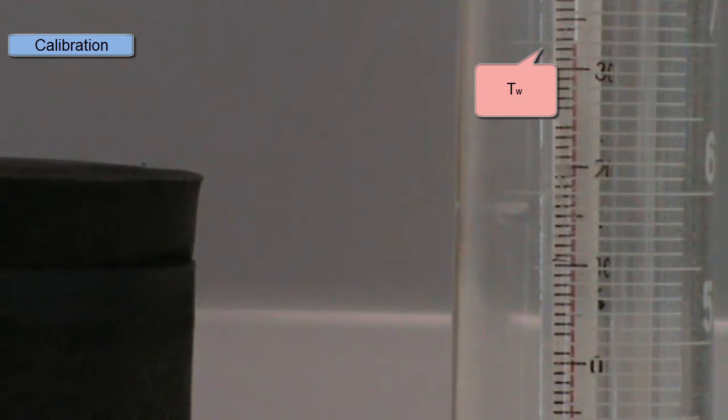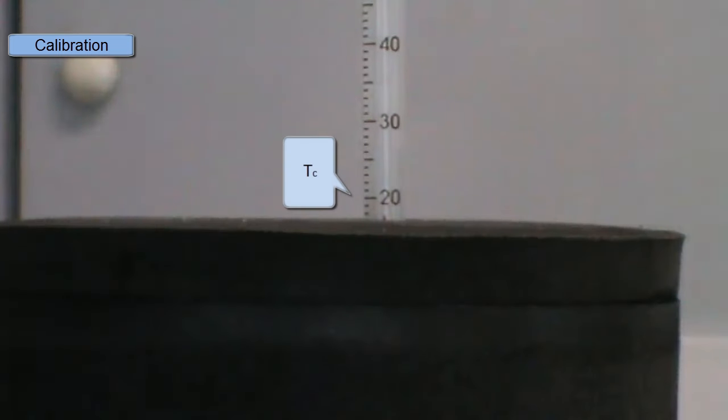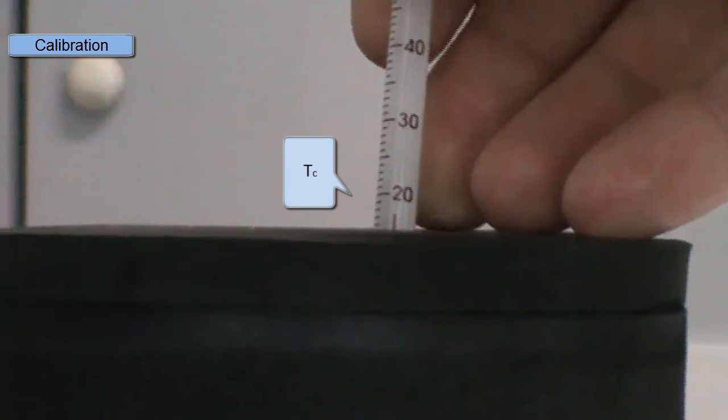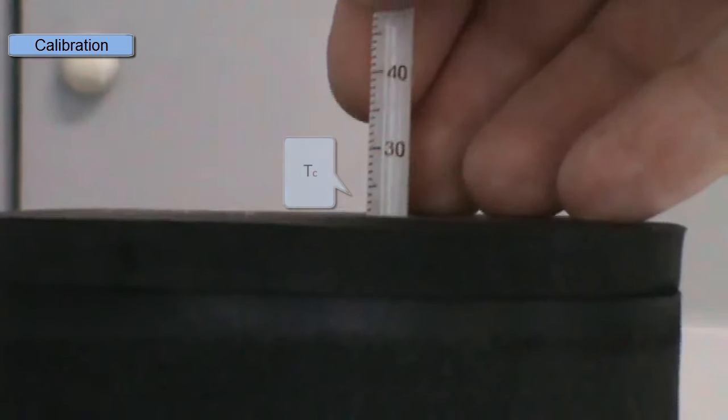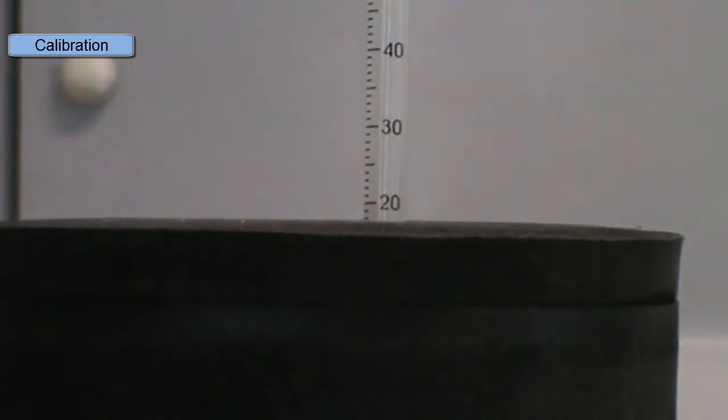So our temperature of our warm water here is just under 33 degrees and the temperature of the cold water is just 18 degrees. So in this experiment, the cold water is going to gain some heat, the warm water is going to lose some heat.